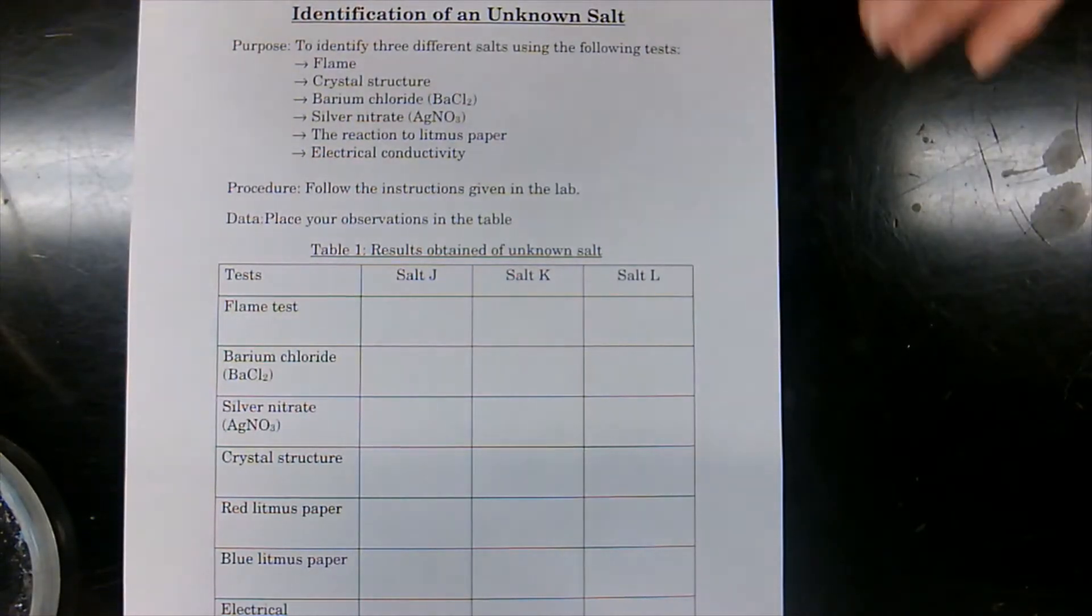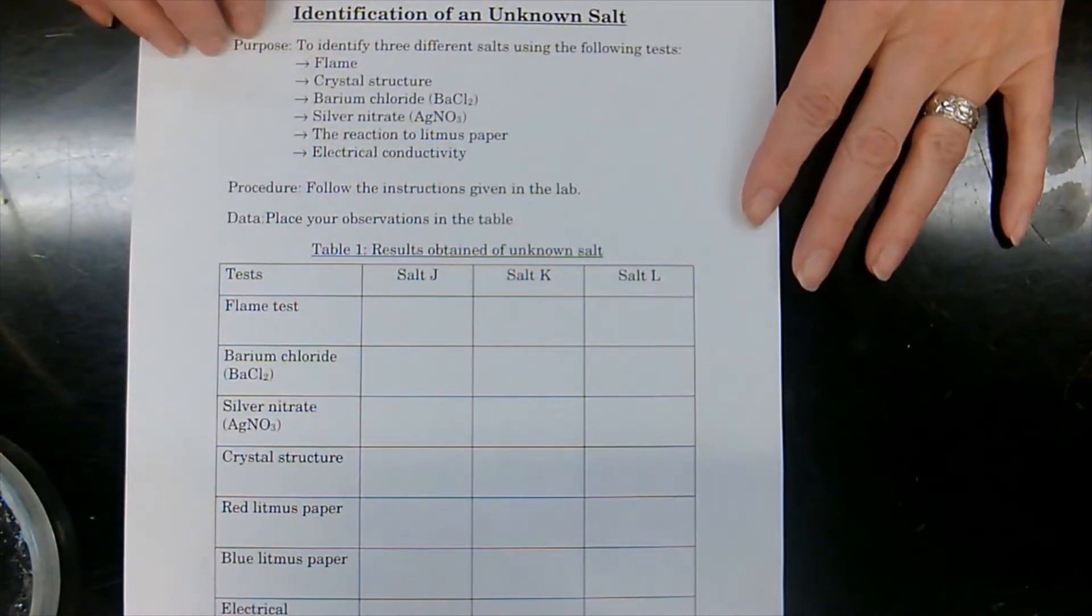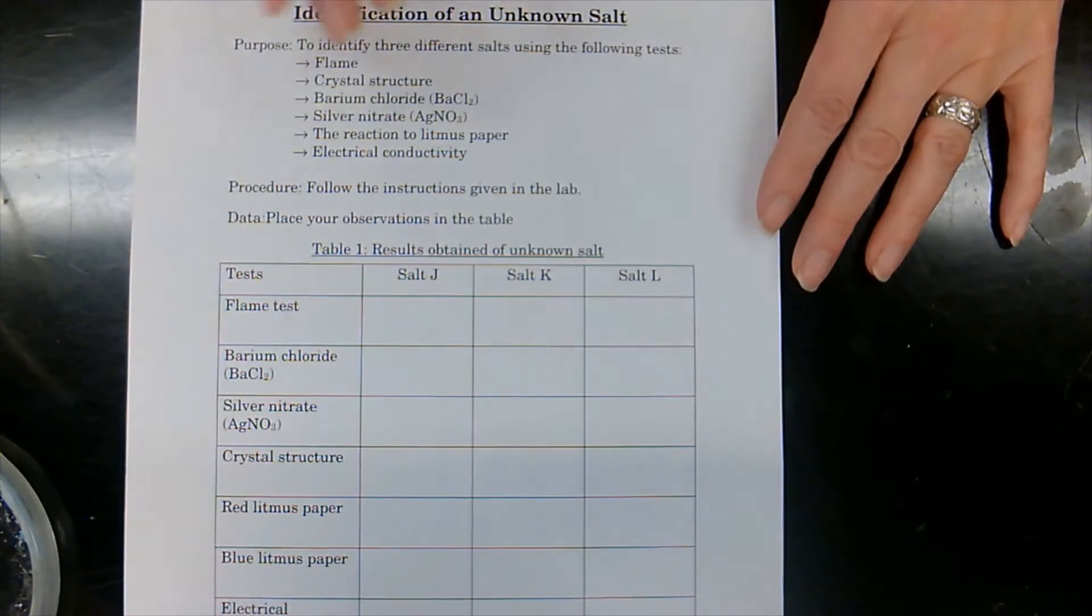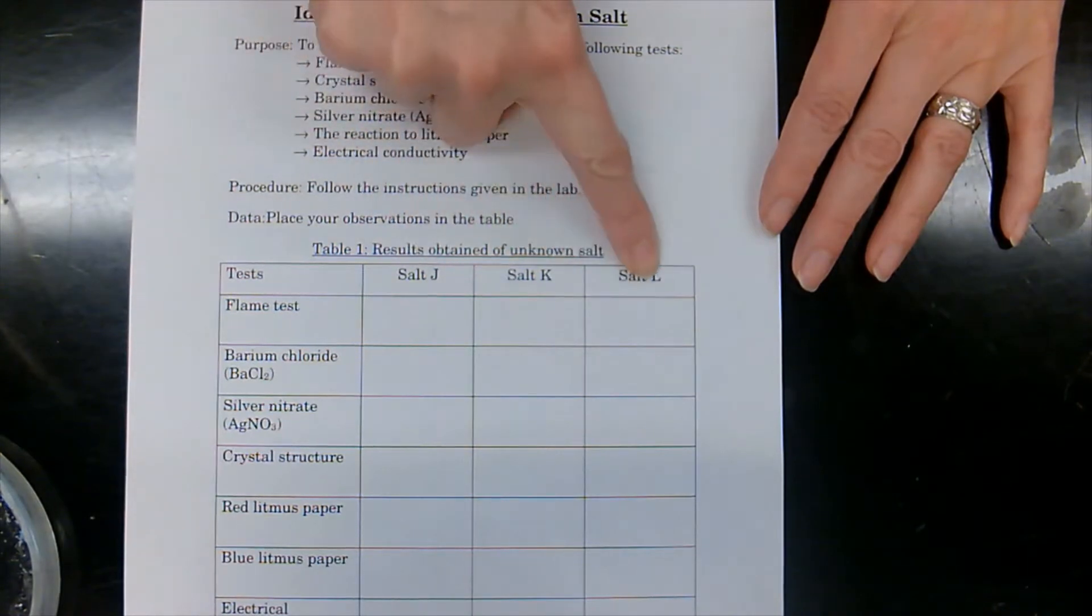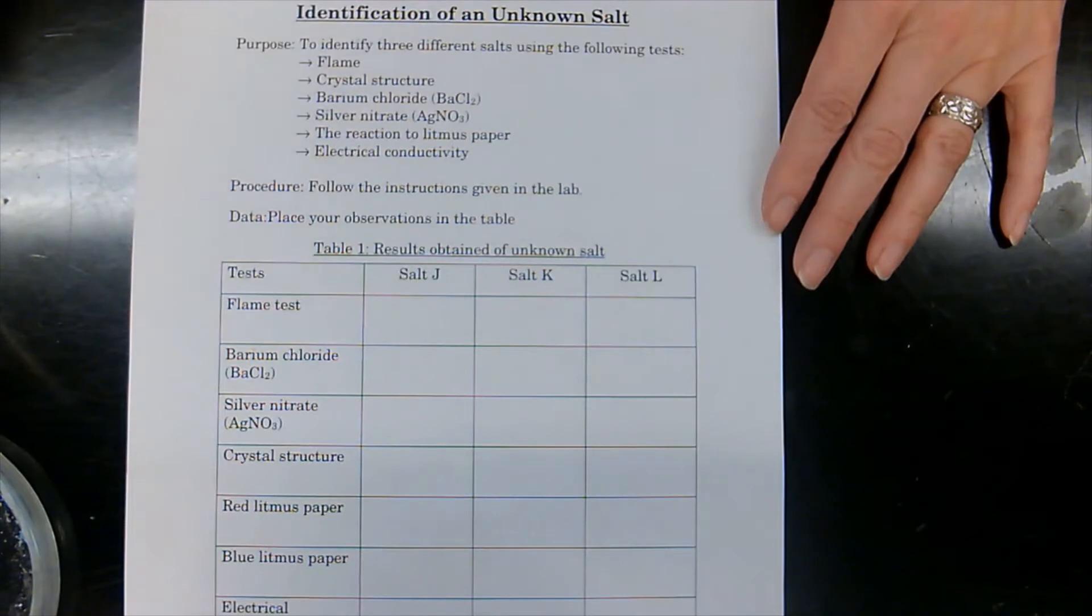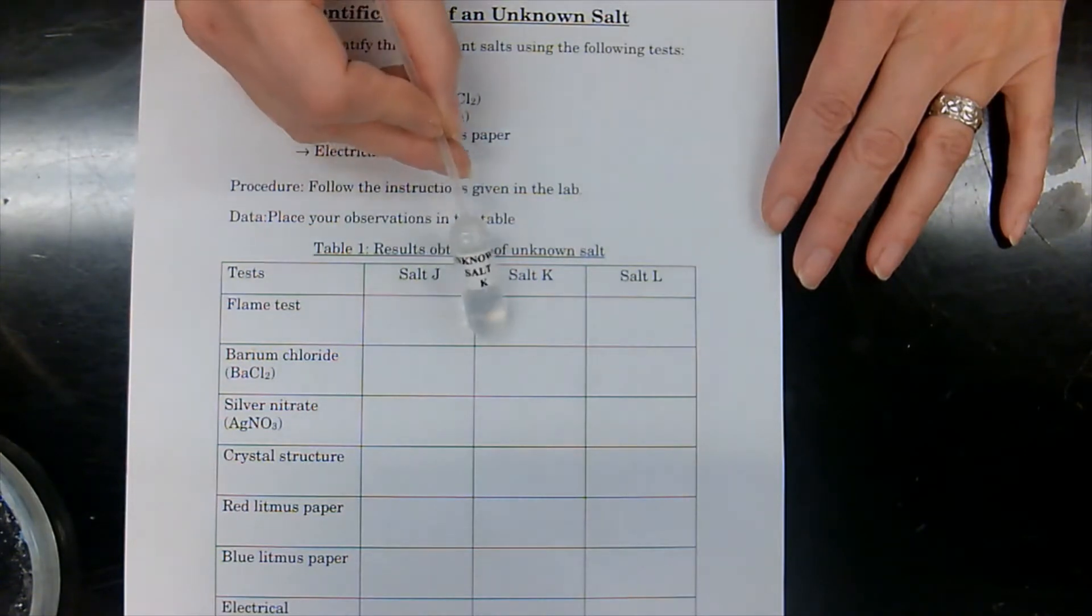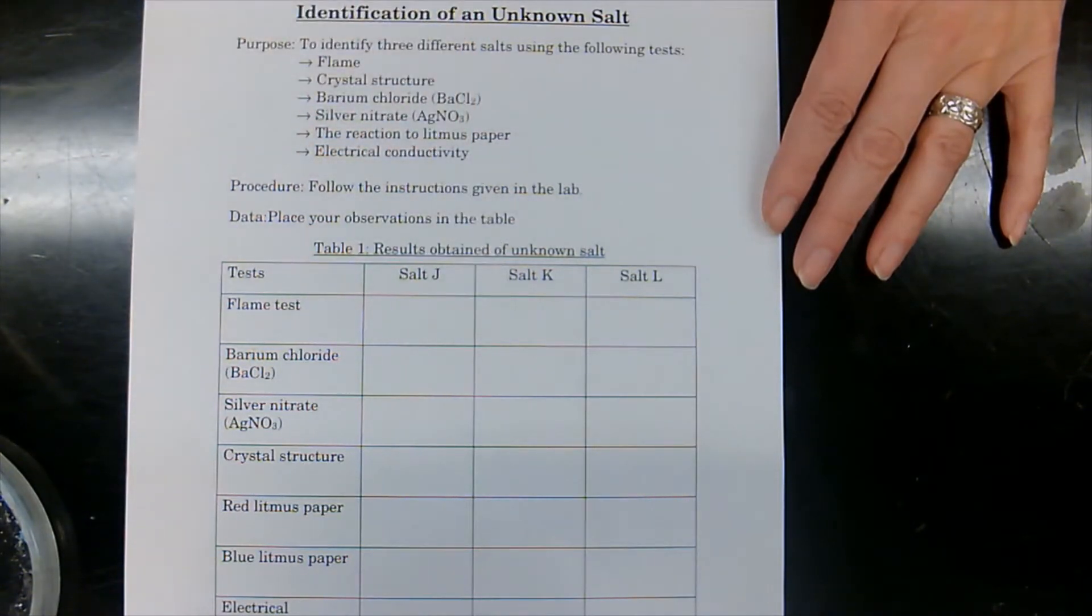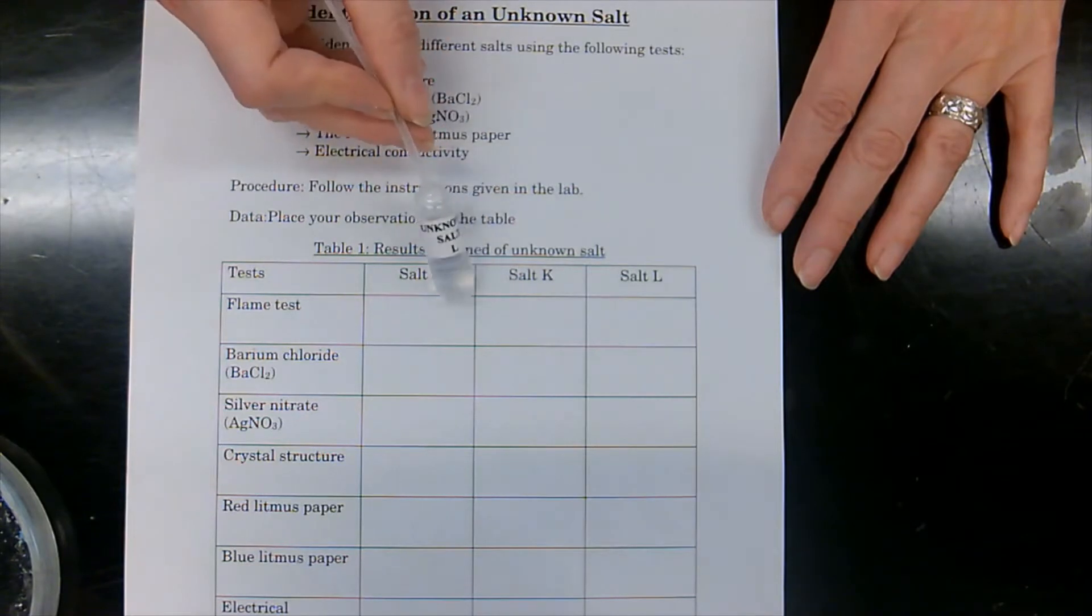All right, so today we're going to be doing another lab. This lab is identification of an unknown salt. So we have three unknown salts: salt J, K, and L. So here we have unknown salt J, unknown salt K, and unknown salt L.